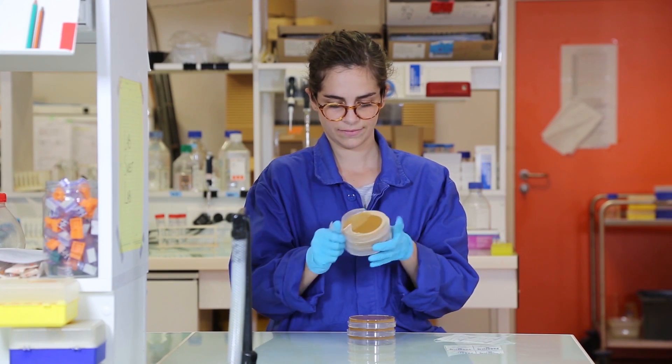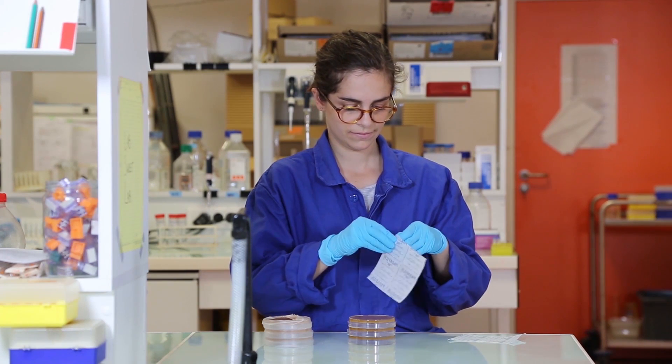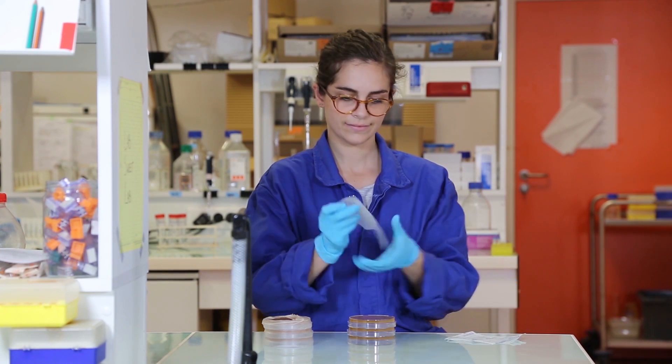Since we only plated 100 microliters, first we multiply the number of colonies we have times 10. Then we multiply times the dilution factor.